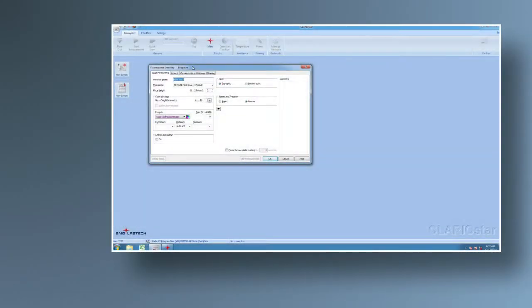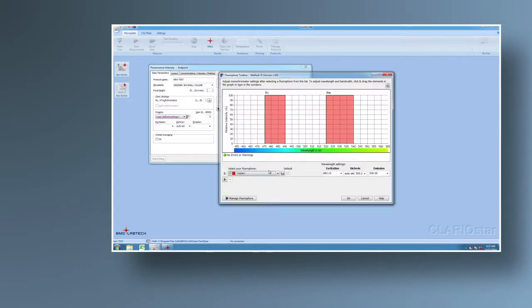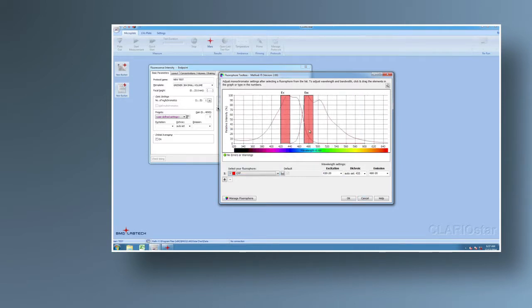Direct detection optics don't just make the Clariostar work better — they make it easier to use. An intuitive handling of the LVF monochromator is ensured by BMG Labtech's Flora for Toolbox. Spectra and BMG Labtech's recommended settings for almost all commonly used assays are already pre-saved. Users can easily adjust wavelength and bandwidth settings by drag and drop.